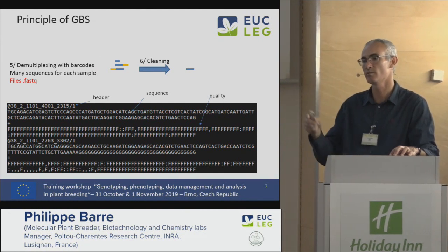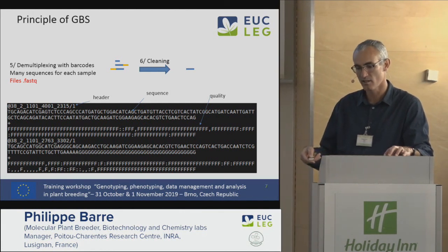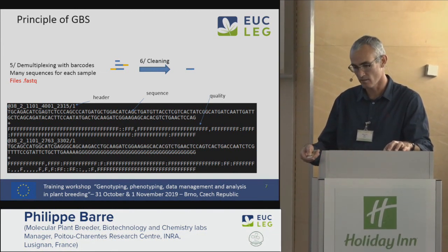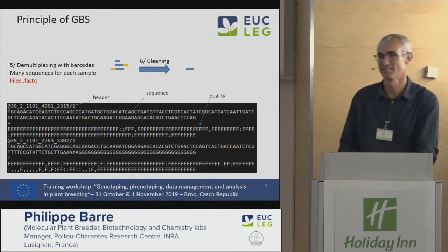And during the demultiplexing, we threw it away. And often, in fact, this is made by the sequence provider. Okay. But you're right. You have to know which barcode you have here. That's right. And it was the step after. Yeah. Thank you.